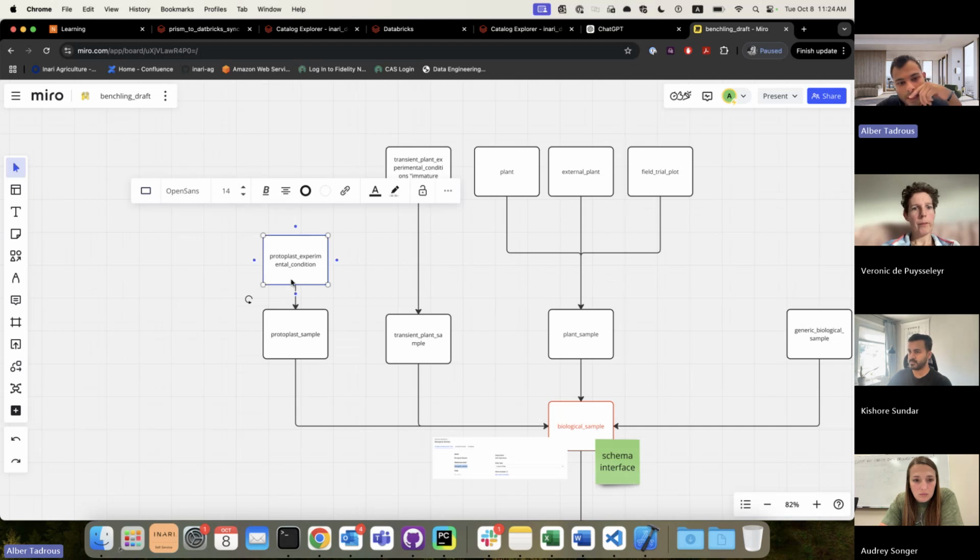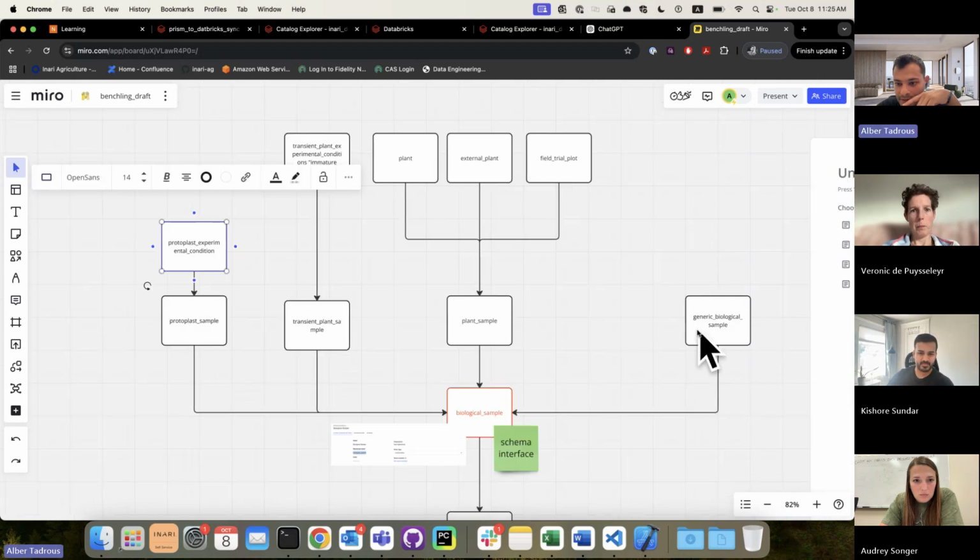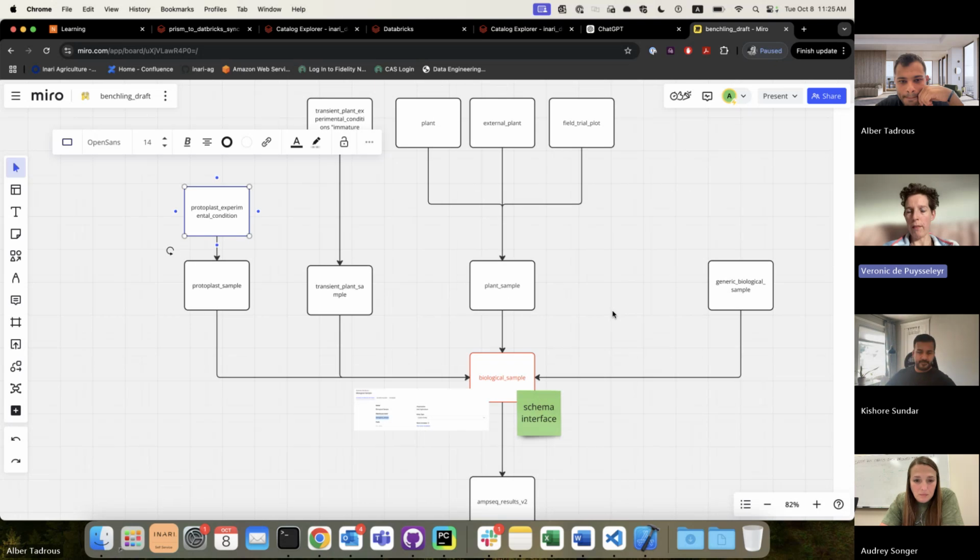So this will be on its own, right? Yes. Okay. And so we don't have any parents for this generic biological sample, right? That is an entry point for us. So if they send over things from West Lafayette that are not registered in our system, but that we want to analyze with our pipeline, we need to have fields like nuclease and guide. And that's how we register things that enter our science organization, but without being registered in Benchling beforehand, which sometimes happens.